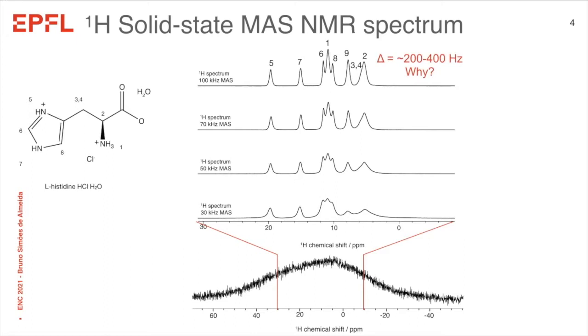To understand the origin of this residual broadening, we've been doing some average Hamiltonian theory analysis, and we found out that both the residual shift and the residual coupling term survive in third order. So we set up the hypothesis that the line shapes obtained here are still limited by residual splitting.